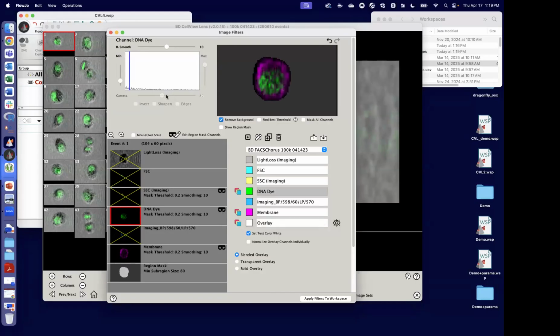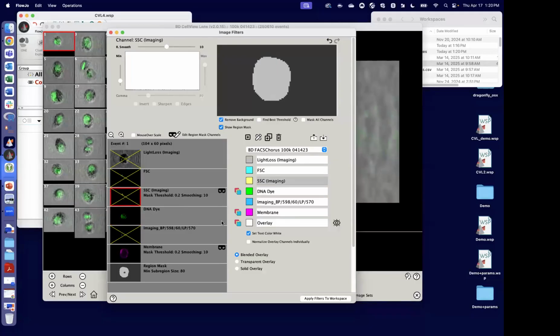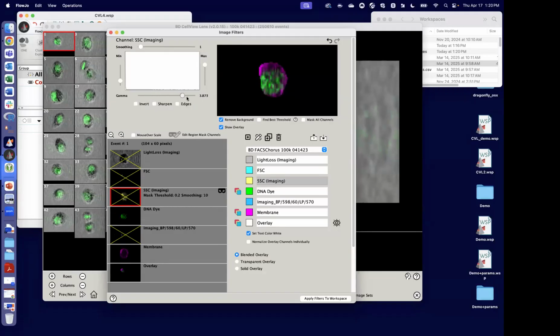I don't know. And then also, if you're in any one of these, then the adjustments here are going to be for, we can show the mask region if we want to. That's kind of a fun thing. If you've got edit mask selected, then this will actually, you can see, be a slider for how big the mask is. I just want to put it on one channel to emphasize exactly what we're doing, but I do like using multiple channels to figure out the best mask.